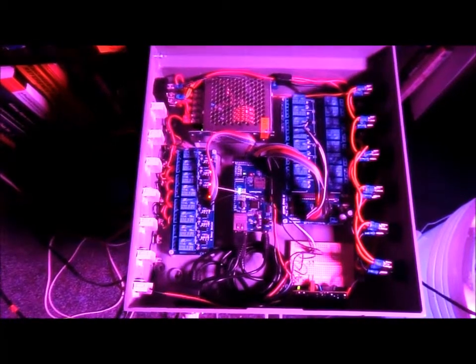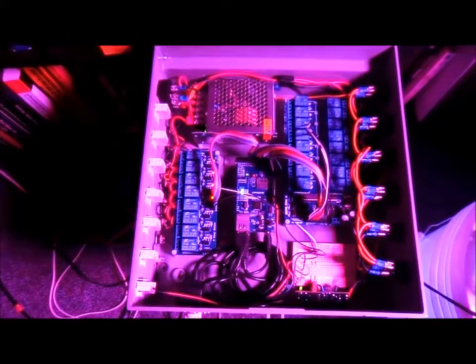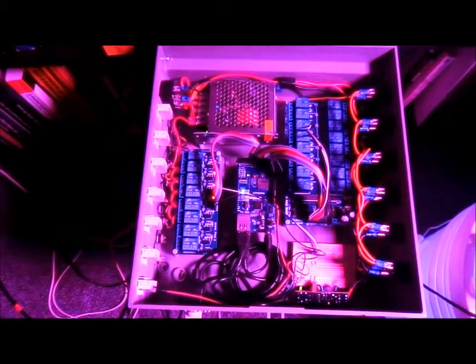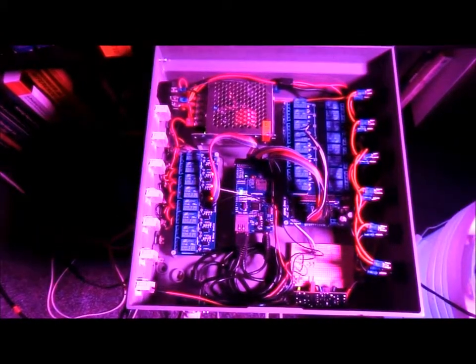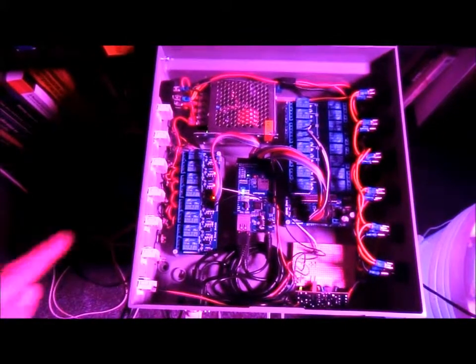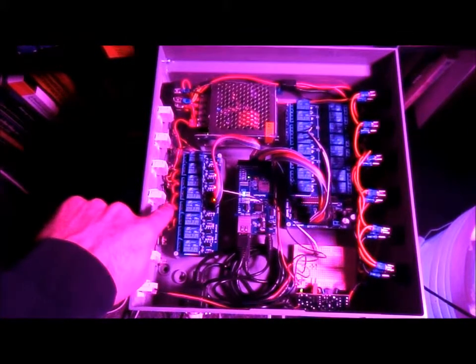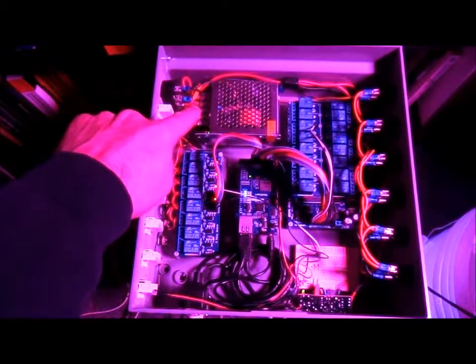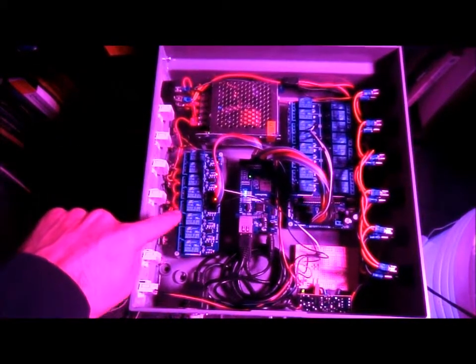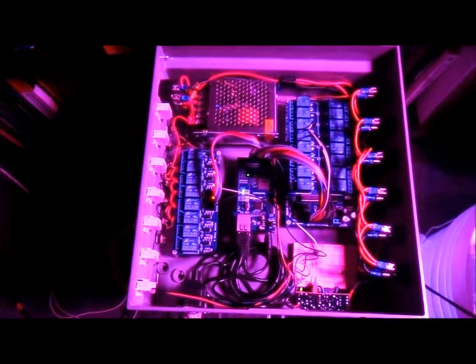I'll talk to you briefly about the other components of this system. There's two relays in it that result in a DC bus and an AC bus. So this is an eight-channel relay here and it's coming off of an AC to DC converter. So this is the 12 volt DC bus.